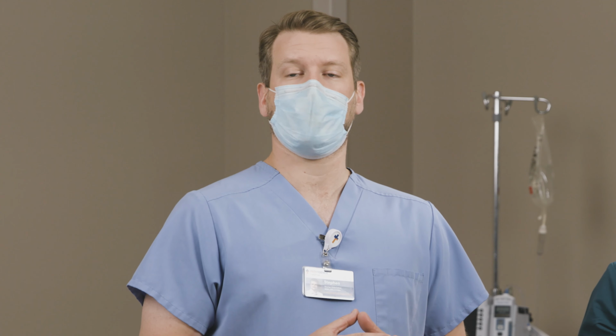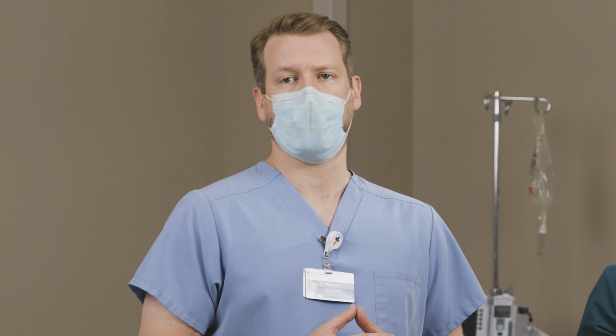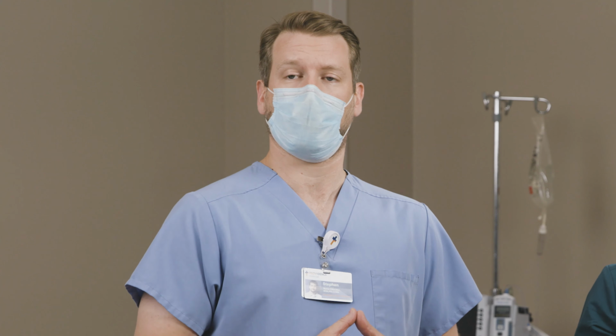As you're doing your donning and doffing, be consistent and go slow. It's the most important thing we can do to help keep ourselves safe.